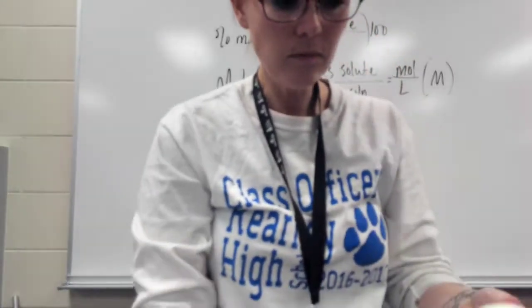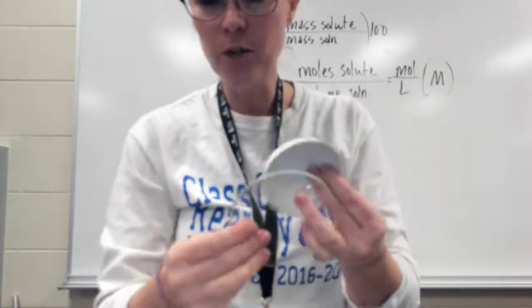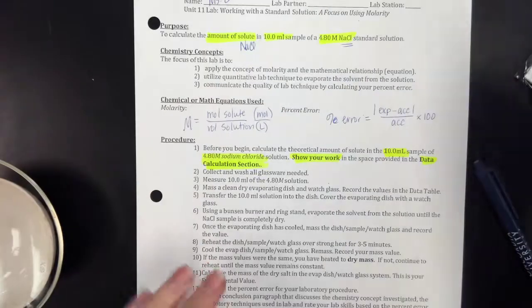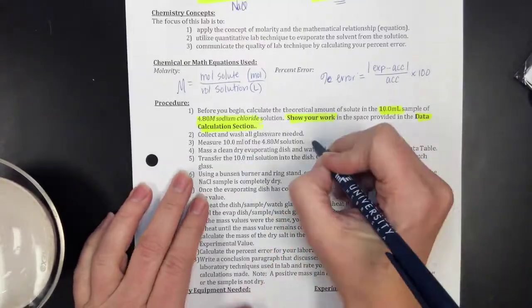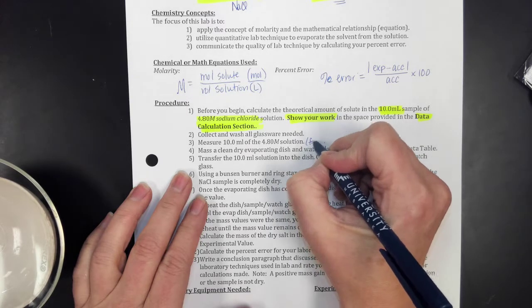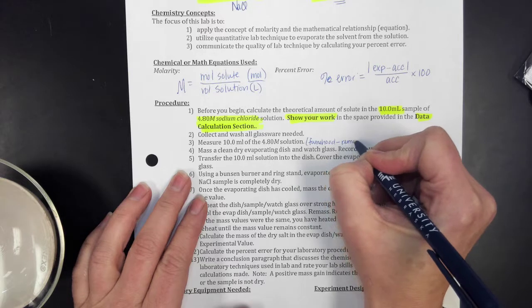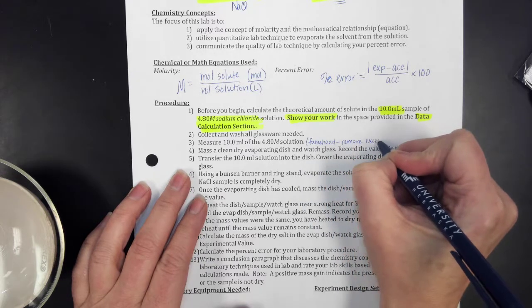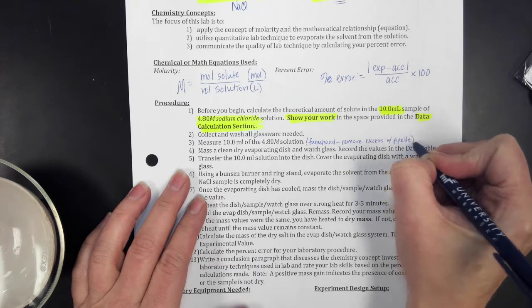I've washed and dried my evaporating dish and my watch glass. So it says next to mass. Let's go back to our lab protocol. Collect and wash, measure 10 milliliters. This is in the fume hood. And then remove excess with a pipette.